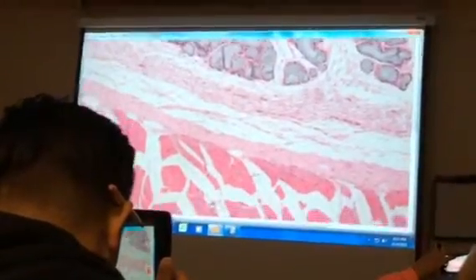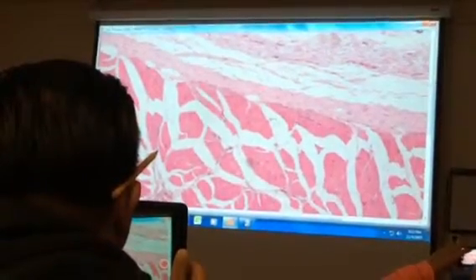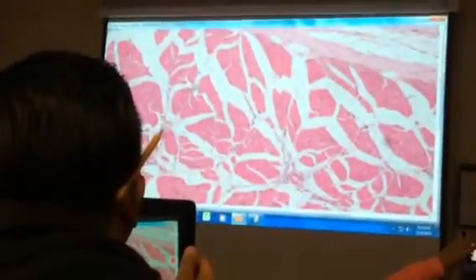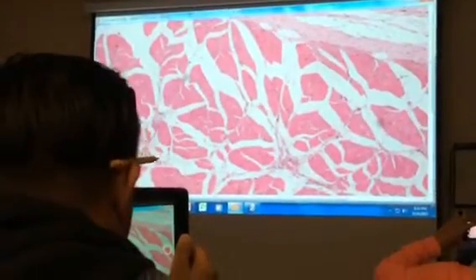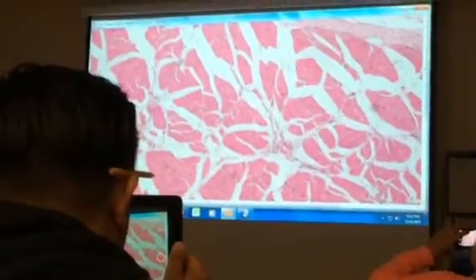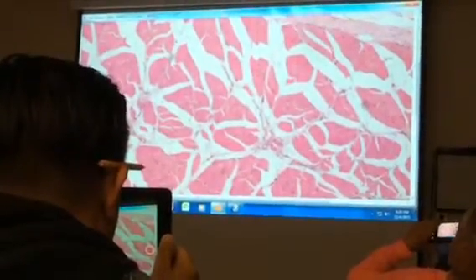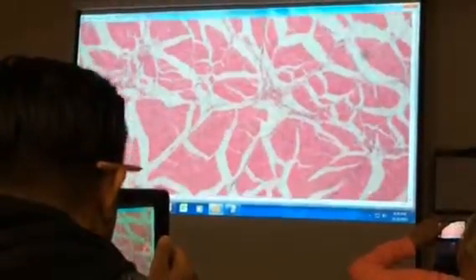And okay, now we see muscle. See a change right here. So what main layer is this? This is the muscularis externa. Yeah, because there's another little muscle layer. They call this one the externa. This is the thick one. This is almost always smooth muscle, except the esophagus is a little weird. At the top, it starts out skeletal muscle, and then it changes to smooth muscle. So in this case, since we're looking at the top part of the esophagus, this is actually skeletal muscle.